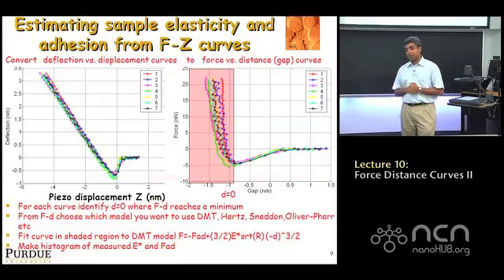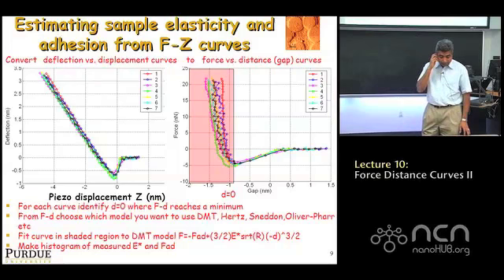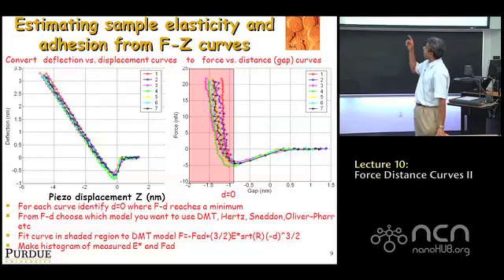So there's a lot of interest, for example, in probing the elastic properties of the material, the epoxy that holds these fibers together. One way to do this is the AFM, because if you look at the gaps between the carbon fibers, they range from a few nanometers when the fibers are very close together to a few microns. So what is expected is that the polymer or epoxy properties ought to change in these small regions in between the fibers due to two effects.